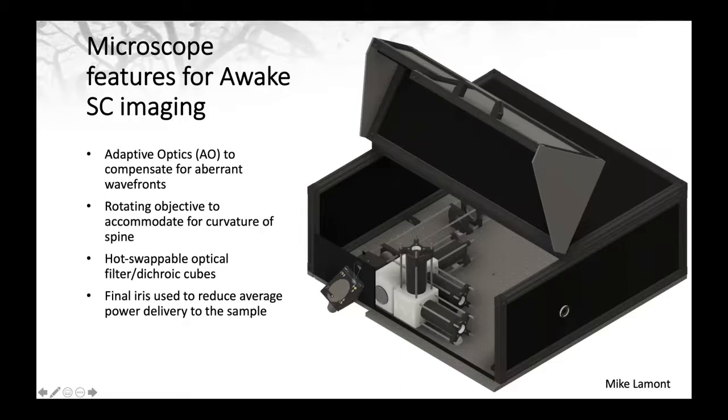In any case, just a few more aspects of this microscope setup. We have a tilting objective. The tilting objective is very useful because of the curvature of the mouse spinal cord. We're able to look at the lumbar region of the spinal cord, which contains the CPG circuits for moving of the hind legs. And with the tilting objective, we're able to have a much better view of those circuits while the mouse is spine fixed on the treadmill.